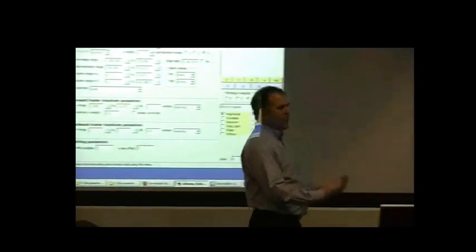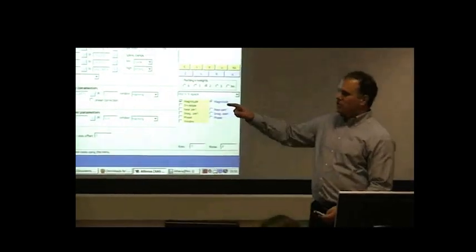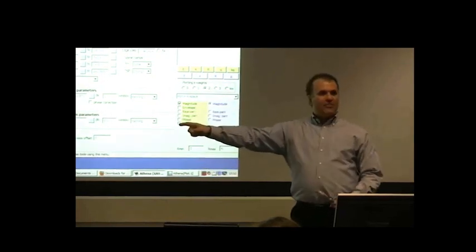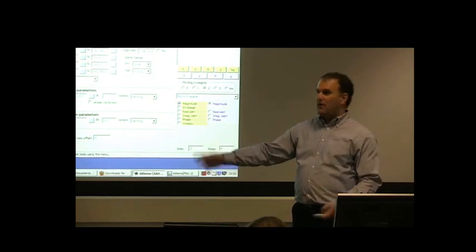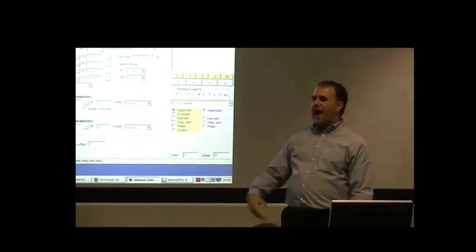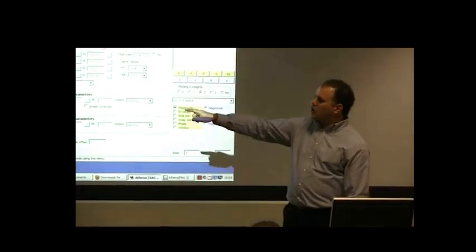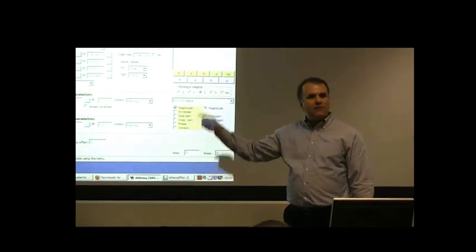It turns out that having a strong spline clamp, that is a big penalty for that happening, is generally a good thing at the end of the data, and generally a bad thing at the beginning of the data, although there are counterexamples for both. The result is that by default, we put a strong penalty on that happening, and that has the effect of, for most data, doing a good job of keeping the spline from deviating from the last few data points of the data.